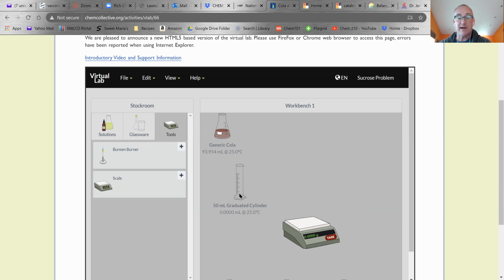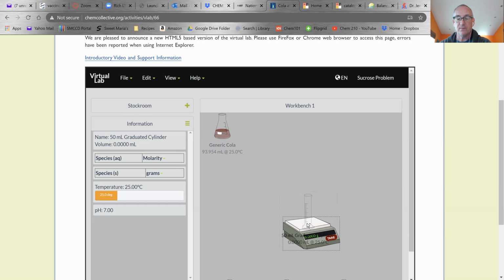Okay, so I take my graduated cylinder. I will measure the mass. You can see it's heavier because typically the glass of a volumetric flask is pretty thin because you don't use it for shaking. You're not making solutions in there, so it's generally quite thin. A graduated cylinder takes a lot of abuse. People are constantly pouring stuff in it and emptying it, and banging it against things. So the glass in the graduated cylinder is much thicker, so it's heavier.